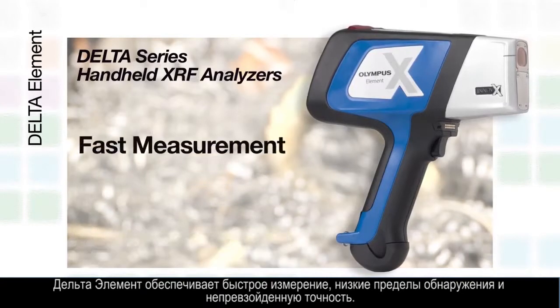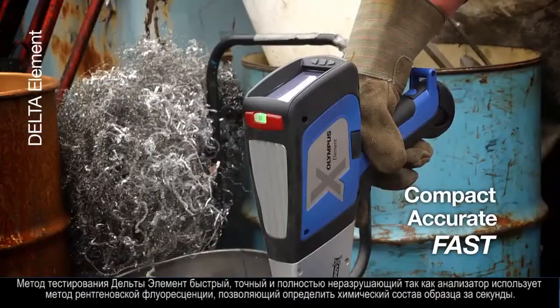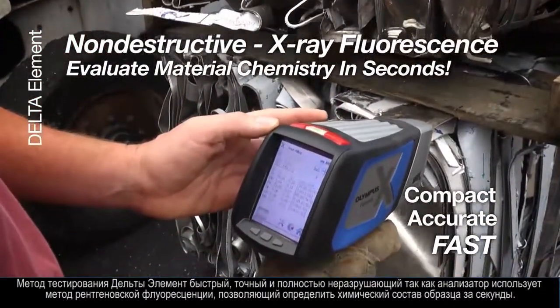The Element offers fast measurement, low limits of detection, and outstanding precision. The Delta Element's compact, accurate, and fast testing is completely non-destructive as it uses X-ray fluorescence to evaluate material chemistry in seconds.